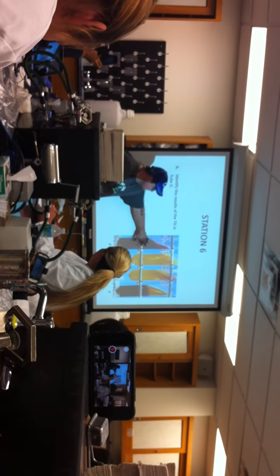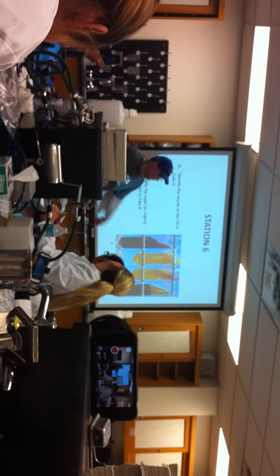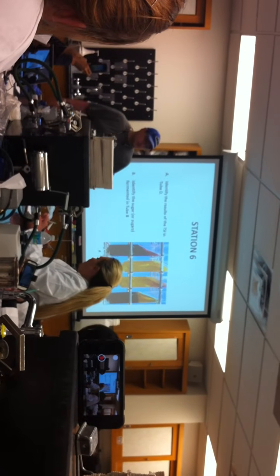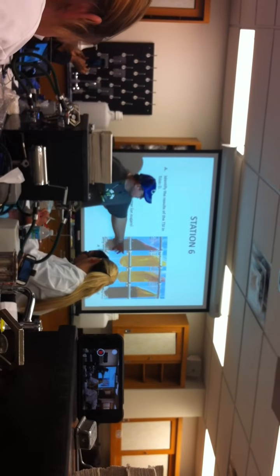And I know the black is going up here, but you have to look at the very top, and that's red, so that's no fermentation. Because these tubes start out red. Yellow is fermentation. You guys with me? All right, next tube, what do we got?